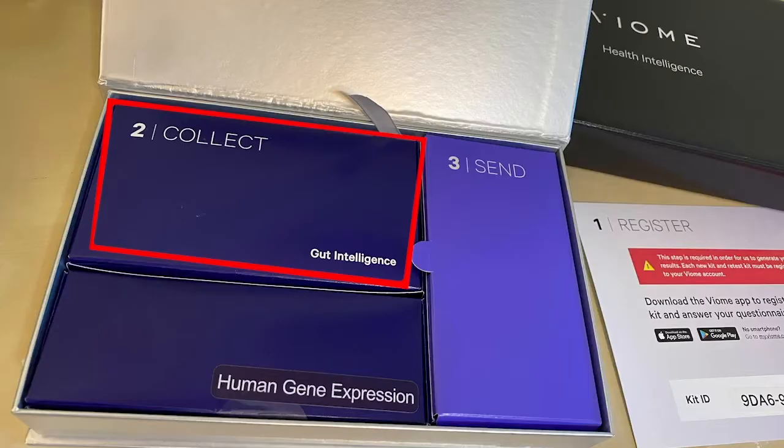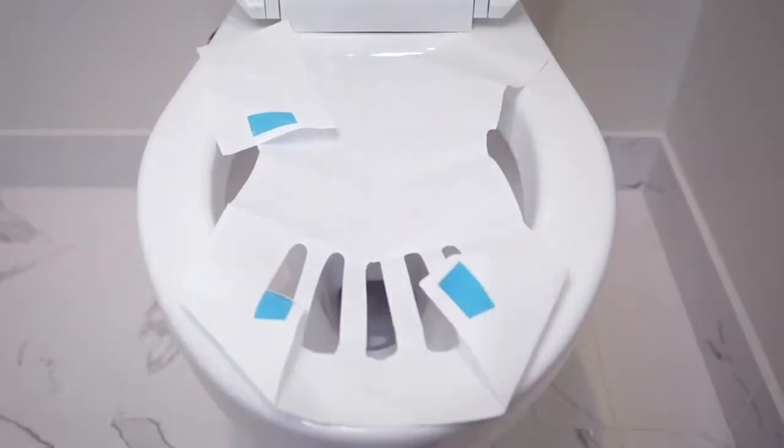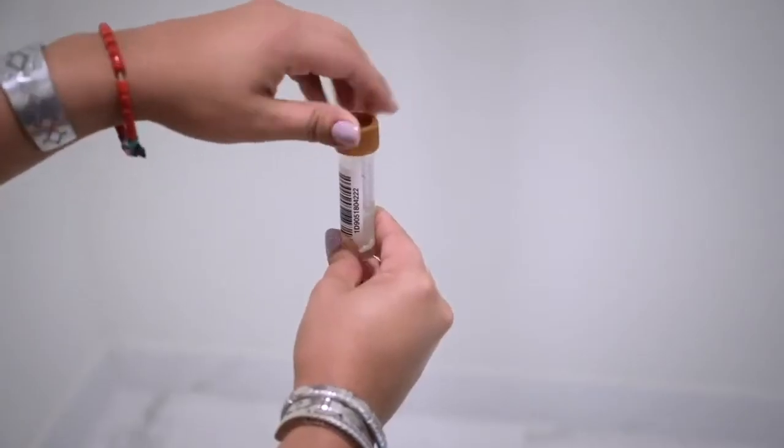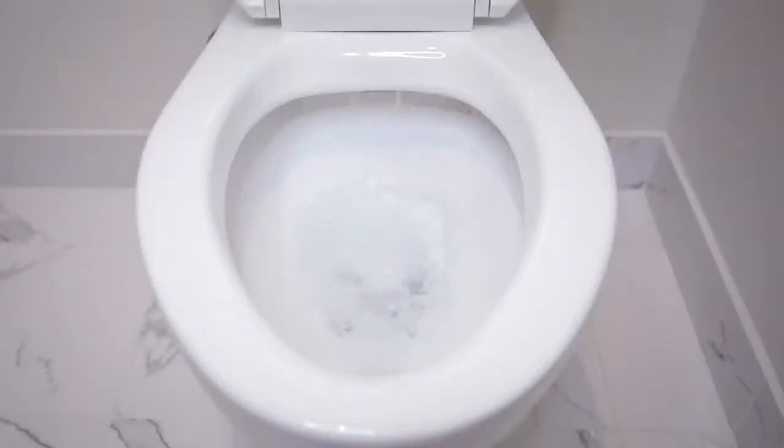Follow along with the full sample instructions located inside your kit. After attaching your collection paper to your toilet bowl and depositing your stool, transfer only one small scoop the size of a pea into your tube and close it tightly. Shake for 30 seconds, then repeat two more times.